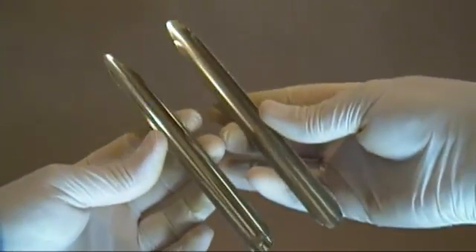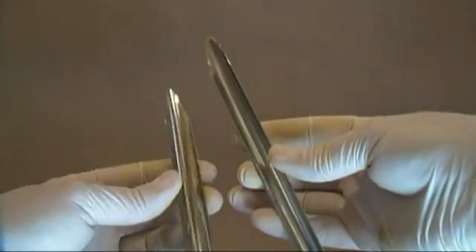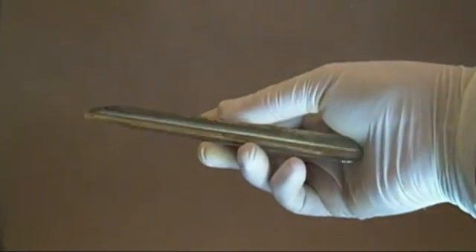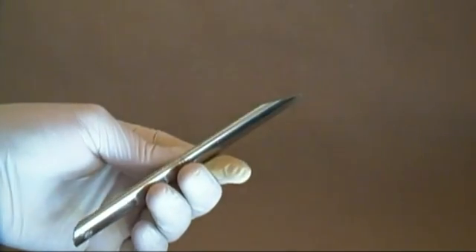Okay, real quick — which of these is a spatula and which is used in jewelry repair? This one is a regular spatula costing about $2 to $3. This one is for jewelry repair and was purchased at Hobby Lobby for $0.50. You can find it in the jewelry making section.